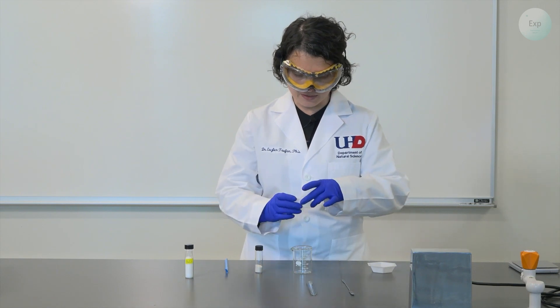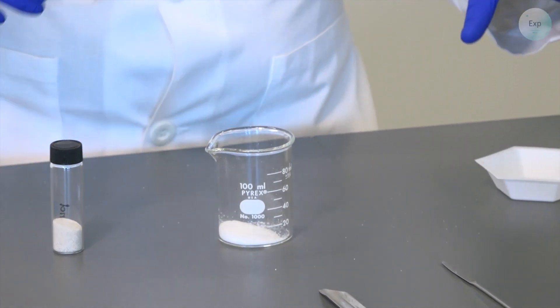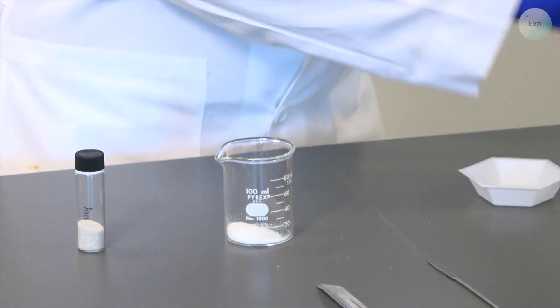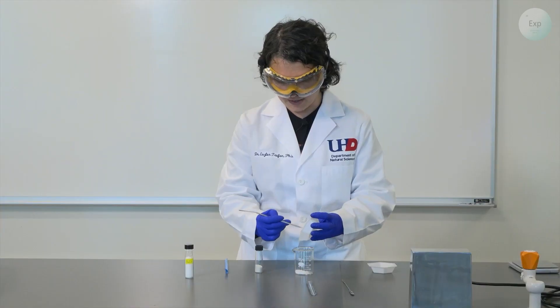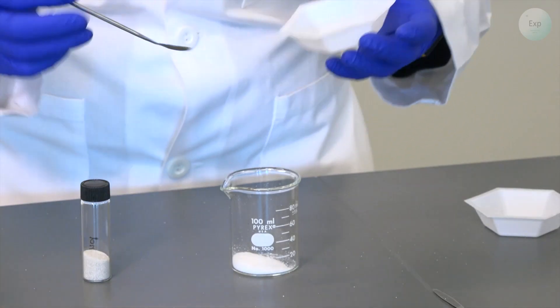Next, I am going to take my salt and transfer it into the beaker. And if something is stuck to the sides of the weighing boat, I can use my spatula that I used for the sodium chloride measurement to transfer everything into it.